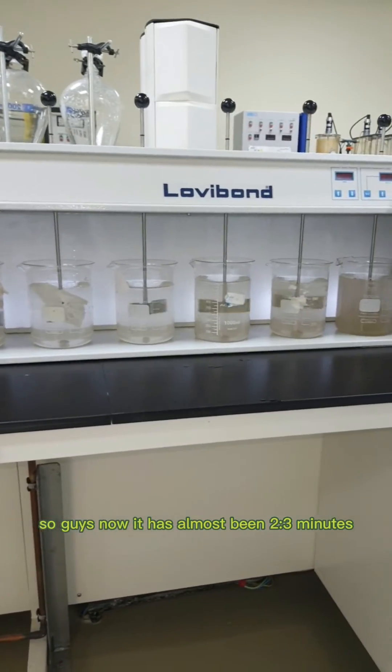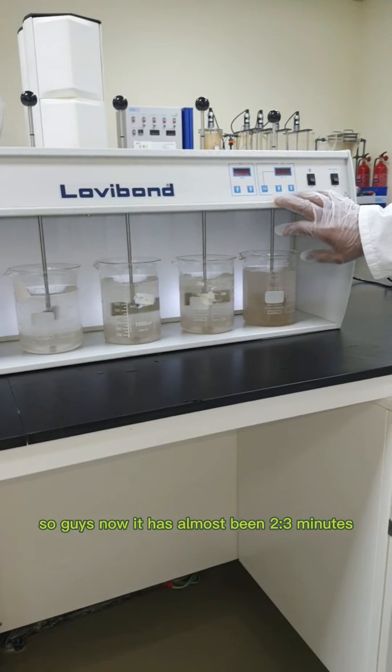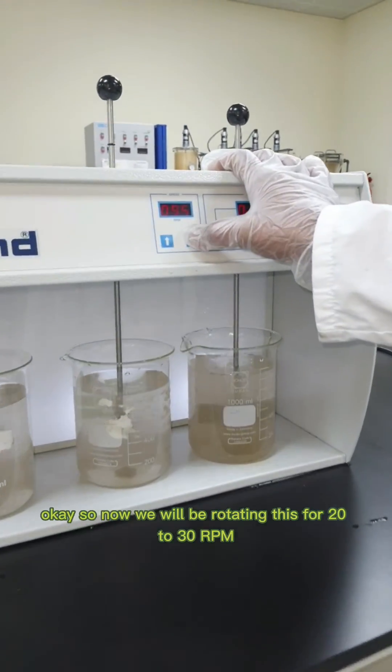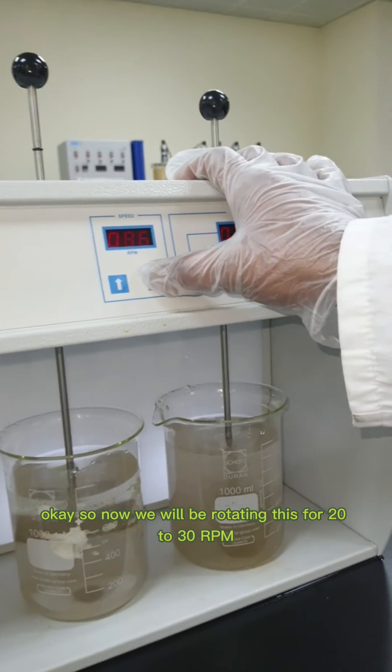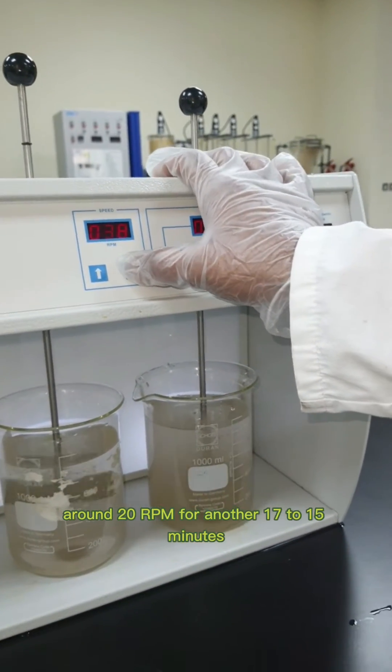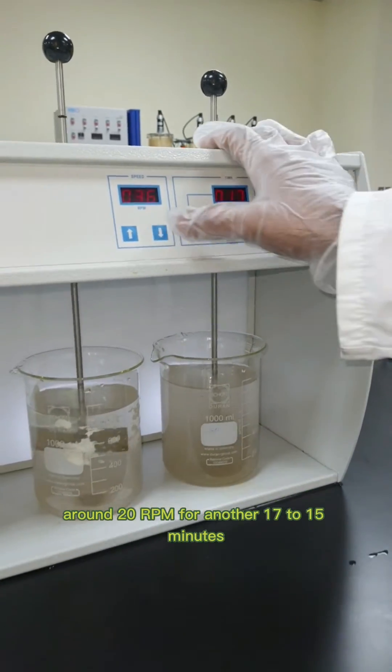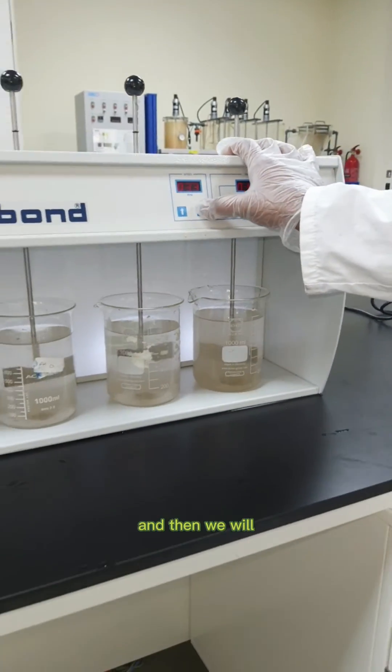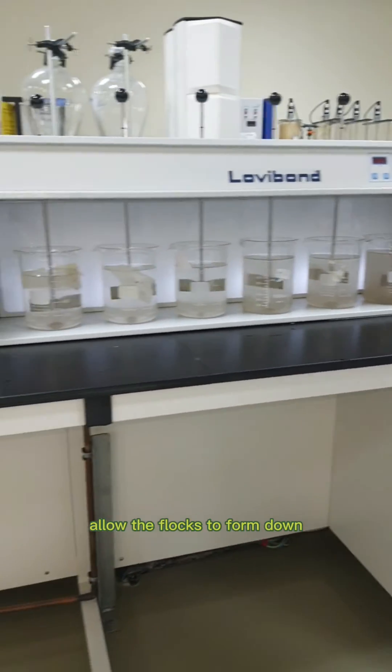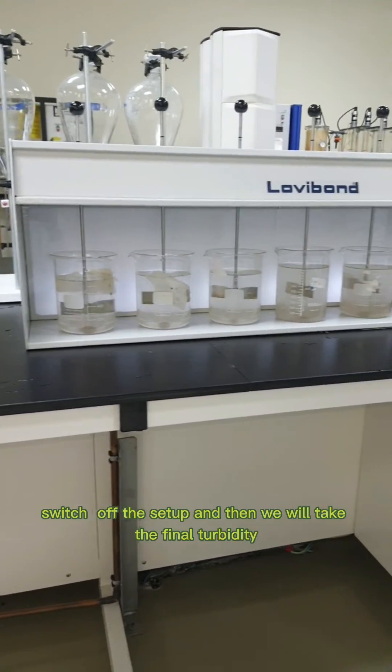It has been two to three minutes at high RPM, so now we will decrease the speed. We will be rotating this at 20 to 30 RPM, around 20 RPM, for another 15 to 17 minutes. Then we will allow the flocs to settle down after switching off the setup, and then we will take the final turbidity.